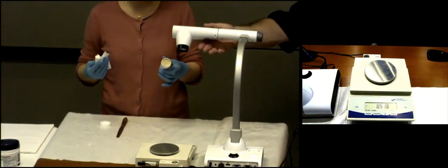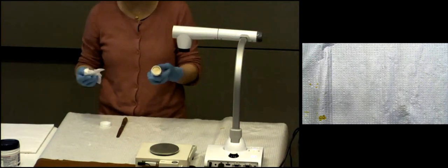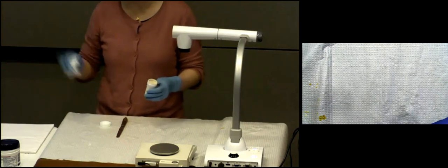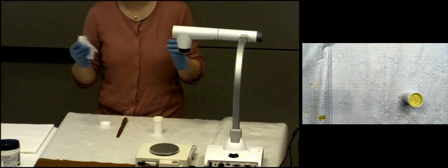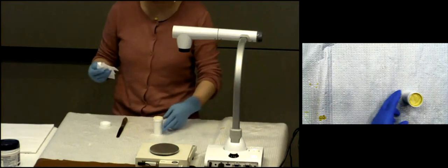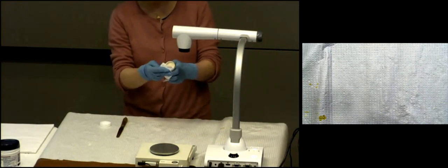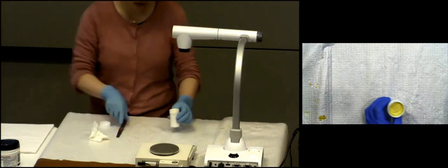All right, so first of all, as Larry pointed out, you want to make sure your bottle is not greasy before you dispense. All right, I don't really have anything on the bottle. What you need to be careful about is your glove. Sometimes if your glove is greasy already, it doesn't really matter how you clean, it's going to be dirty. So in the end, after you clean, before you dispense, take your glove off and check by yourself. Use your bare hand, okay? I do have a little bit on the side, so I want to clean that. Okay, that looks nice.